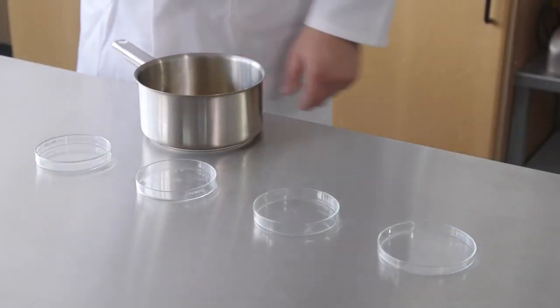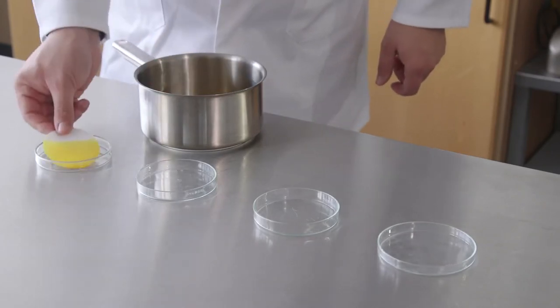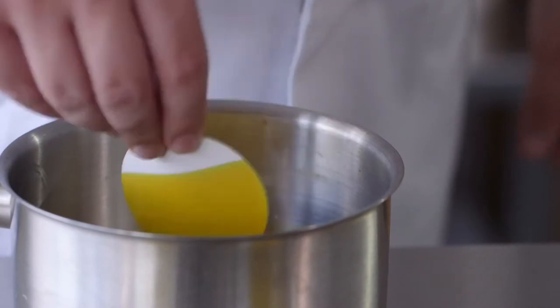Now to the experiment. Take a small disc of filter paper and dip it into the fat. Take it out, then place it in a petri dish. Repeat this until you have four discs in four petri dishes.